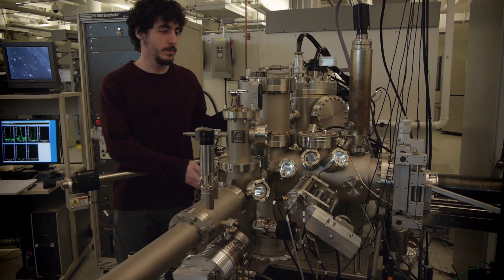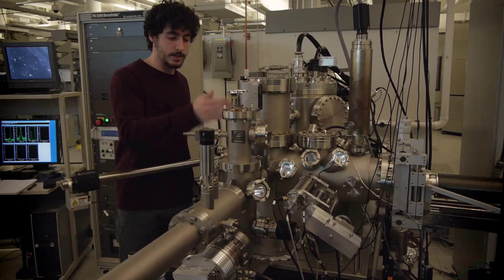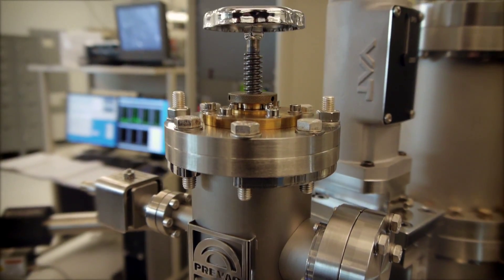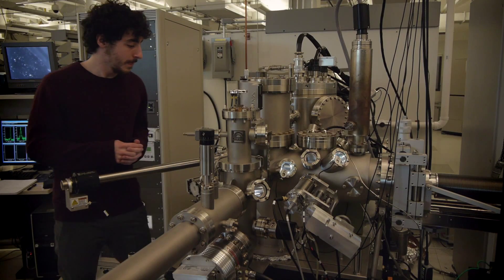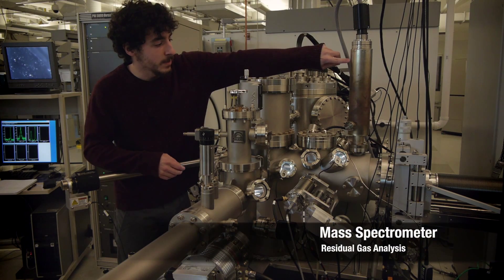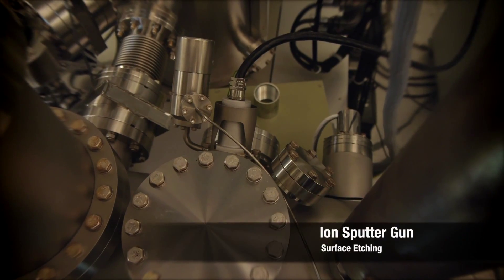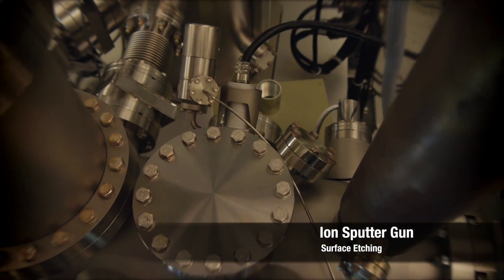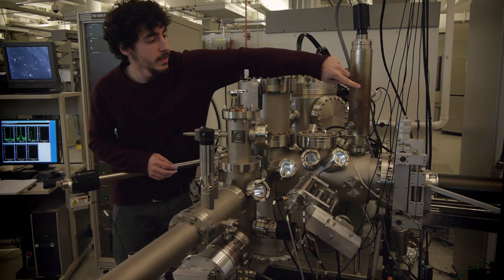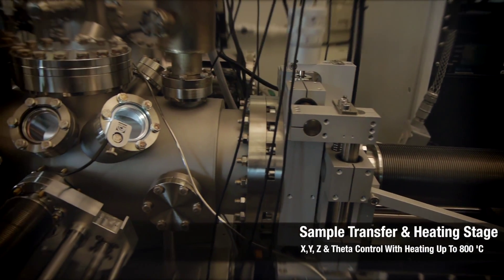This is our sample preparation chamber, and this is a gate valve that locks it off from our load lock here. We try to keep pressure below 1 times 10 to the minus 9 millibar. We have a bunch of different things on this: here is our mass spectrometer, here is our Kelvin probe, and in the back we have a sputter gun to clean the surface of our samples. And that whole assembly is our transfer arm that goes inside and moves our sample around, and it can also do heating.